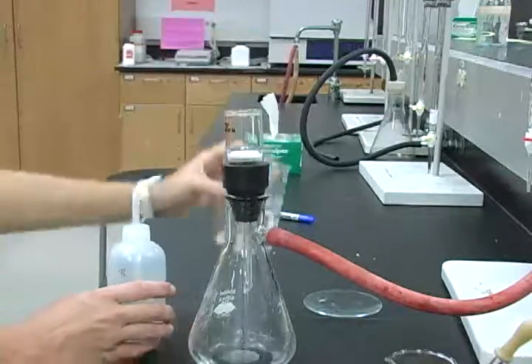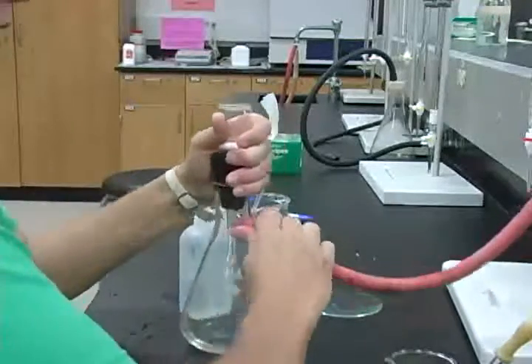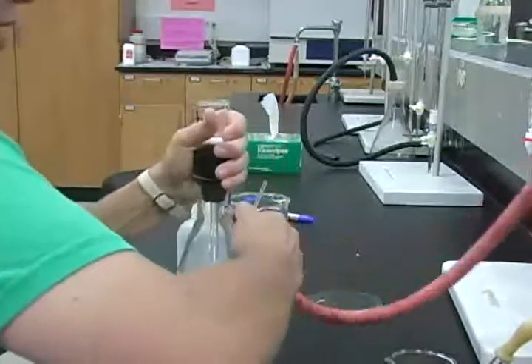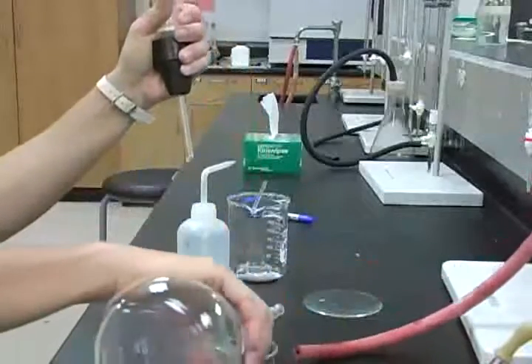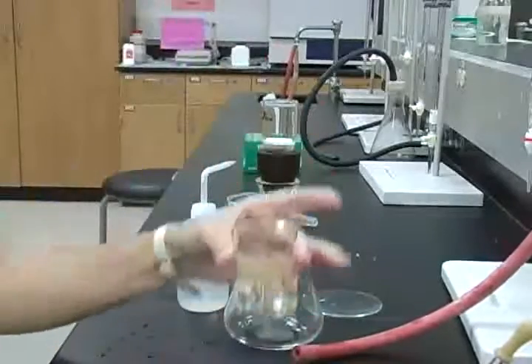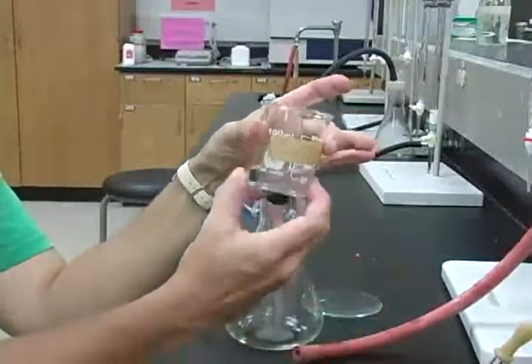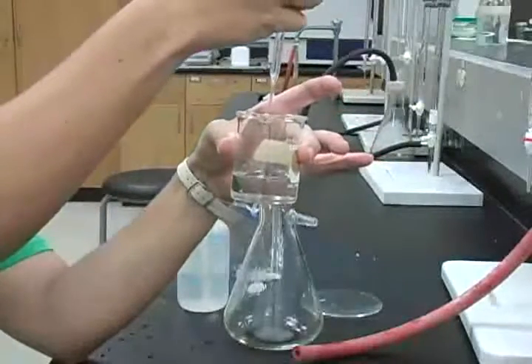To test the filtrate, you want to do so by placing the filtrate into a separate container. Filtrate can be poured into a 100 milliliter beaker. To that beaker's contents, you want to add a couple of drops of concentrated hydrochloric acid.